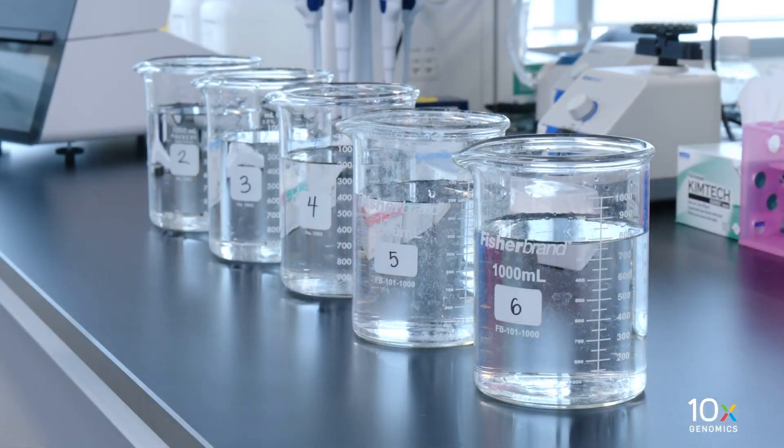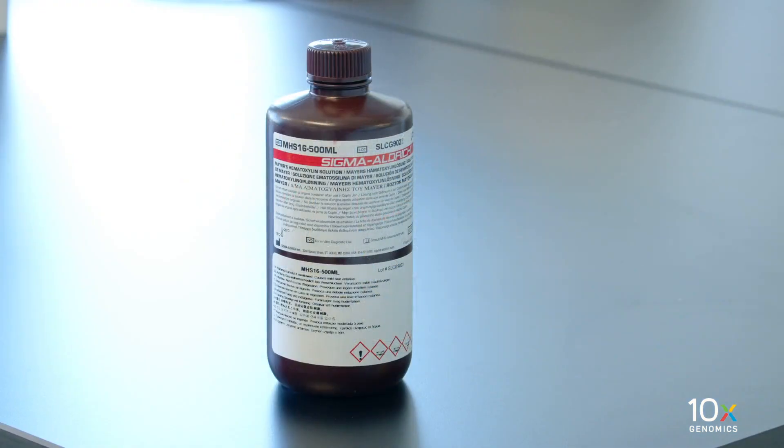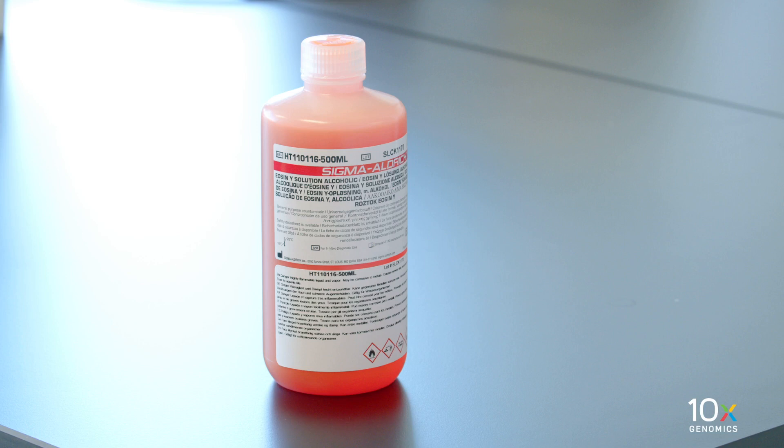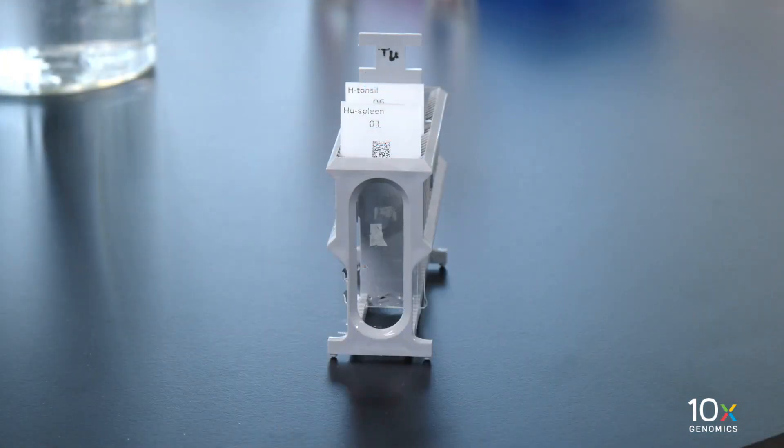We have completed tissue deparaffinization. Now we will stain the tissue. First, we dispense 800 milliliters of MilliQ water into beakers labeled 2 through 6. The dispensed volume in each beaker can be used for two slides. We have hematoxylin, bluing buffer, and alcoholic eosin solution. Finally, we have our slides with the deparaffinized tissue.